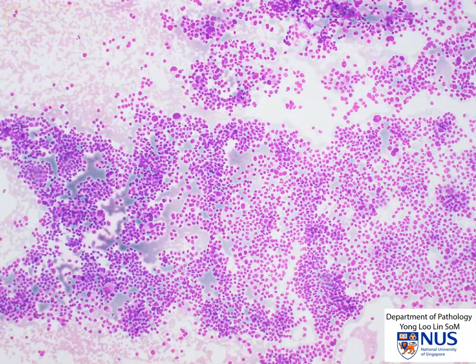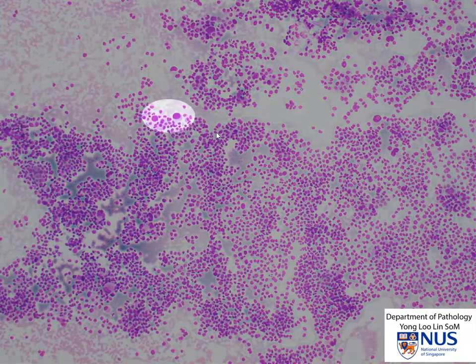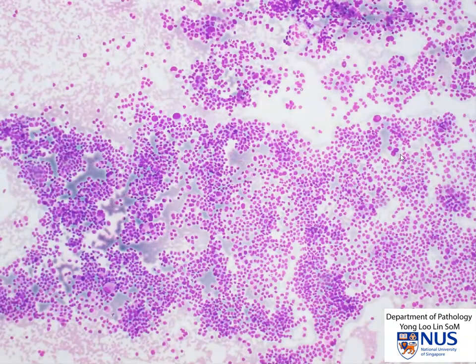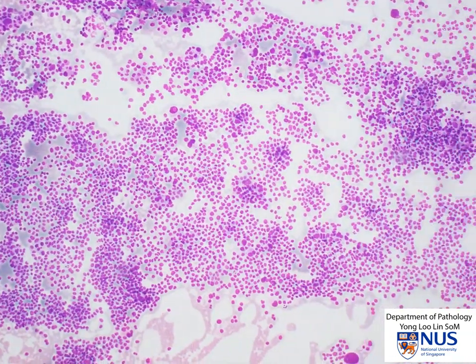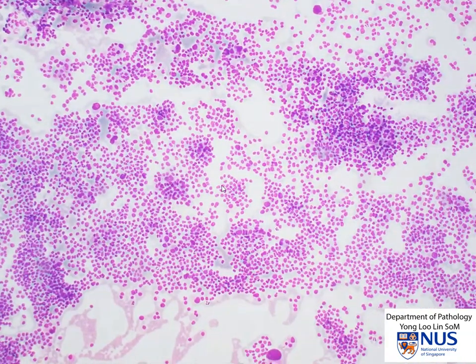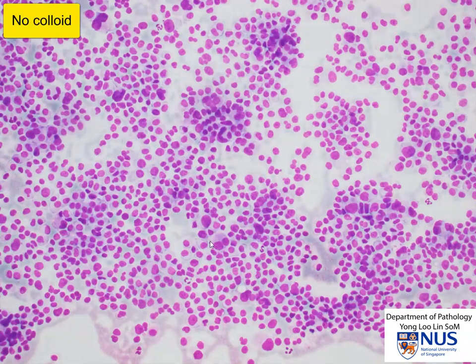At this magnification, we can also see the occasional very large cell and also binucleated cells. The other interesting thing about this smear is that there is no colloid in the background. Again, we have binucleated cells.